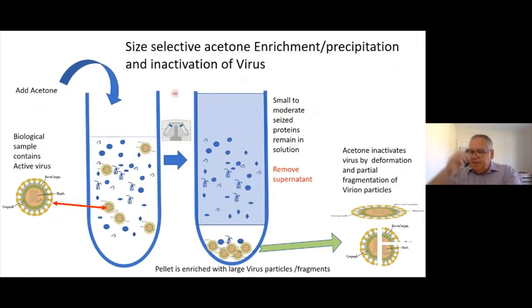So I feel like I'm carrying on from the talk 2 weeks ago, where that one left off with Professor Zintz's group. So, like Professor Zintz and many people around the world, we were looking at acetone precipitation, and we have done this slightly differently. We have moved actually the acetone precipitation, or optimized it for enrichment of the viral particles, and also as a way of getting rid of a lot of small molecules.